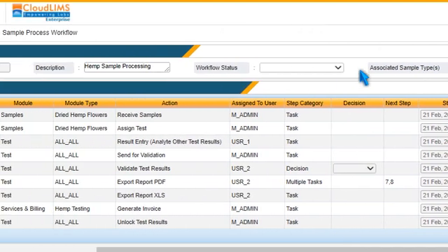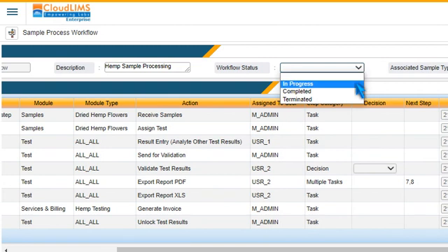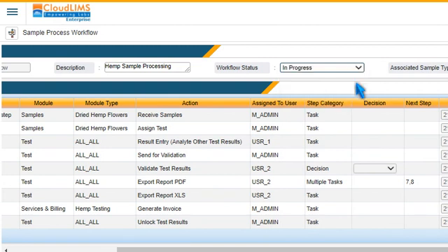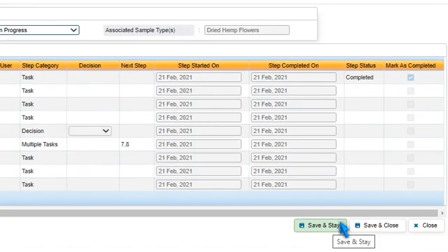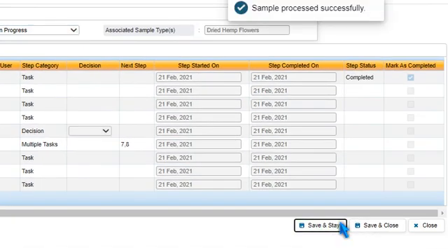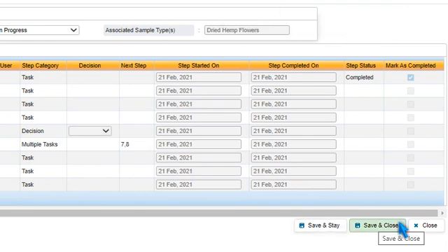You can select a workflow status based on the current sample processing status. Press Save and Stay to save the changes. If there are no further changes, press Save and Close.